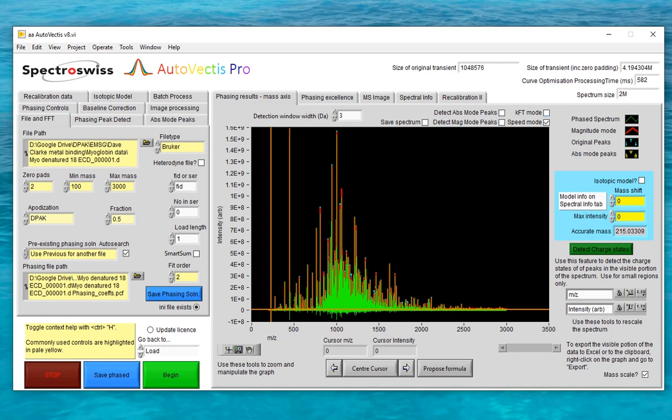To summarise these two routes: once you have a PCF file containing the parameters of a phase correction function, you can use either the Use Previous for this file mode or the Use Previous for another file mode for processing data from either ICR or Orbitrap instruments. The Use Previous for another file route can be particularly useful if you're batch processing a large number of files that were all collected using the same instrument settings. It's also the mode that Autovectus uses under the covers when processing FT mass spectrometry imaging datasets.